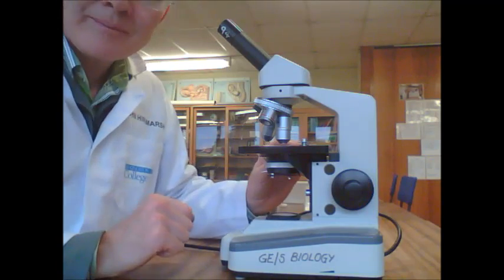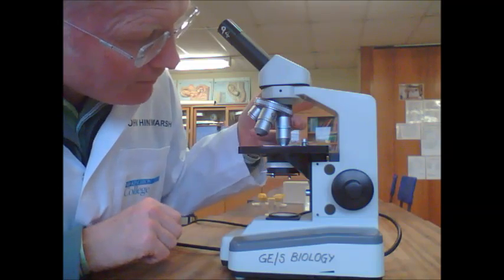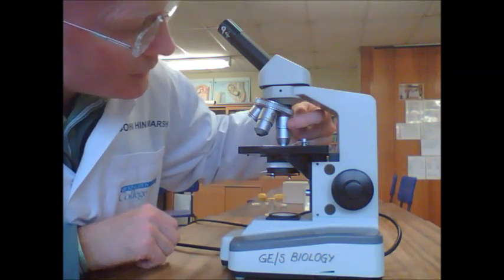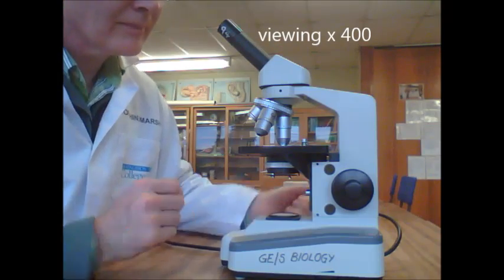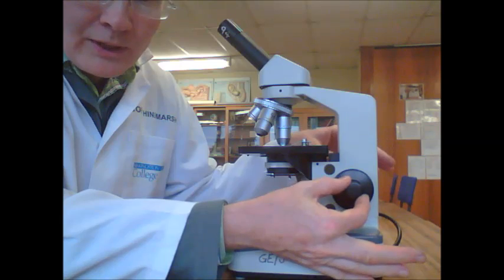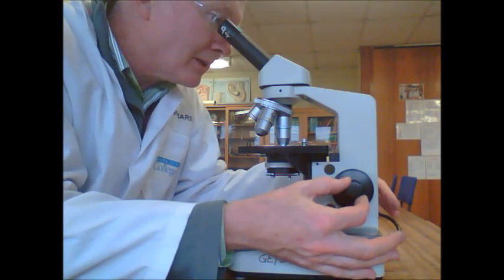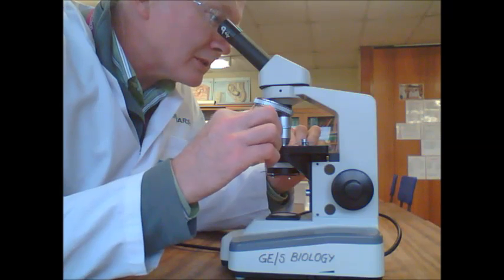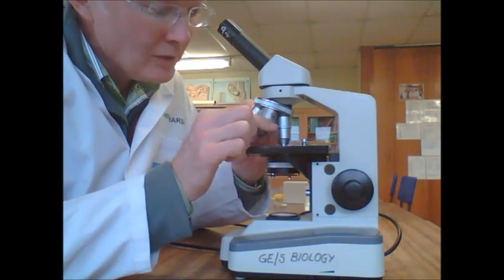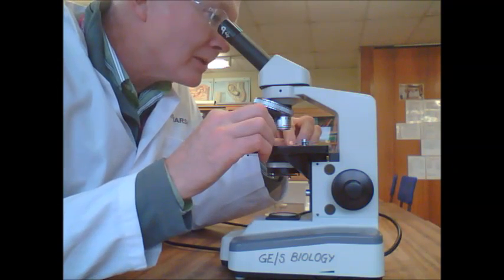To look at highest power, you can click round confidently onto the high power objective. This one says 40 on it, so this is 40 times 10 — that's times 400. This time we're going to focus using the small inner focus knob, or the fine focus. You shouldn't need to move very much. You may need to centralise your slide again.